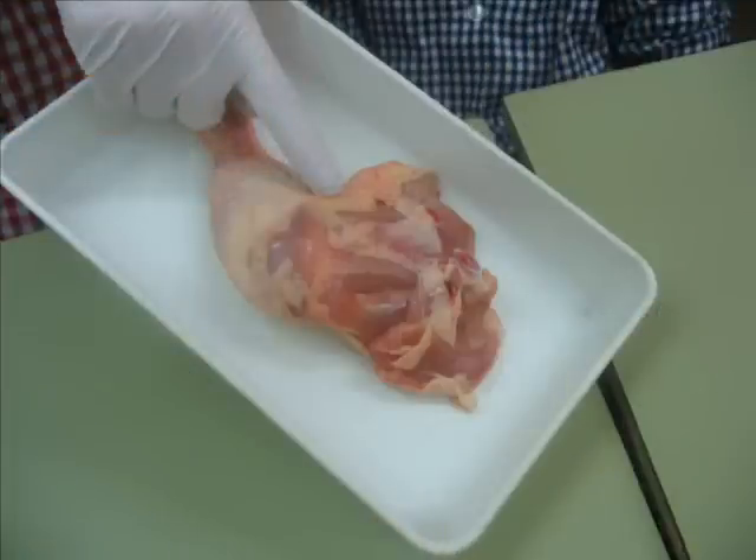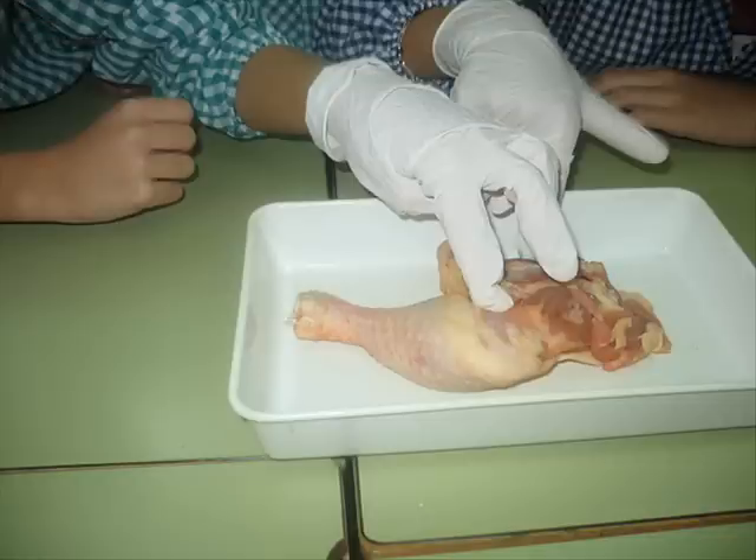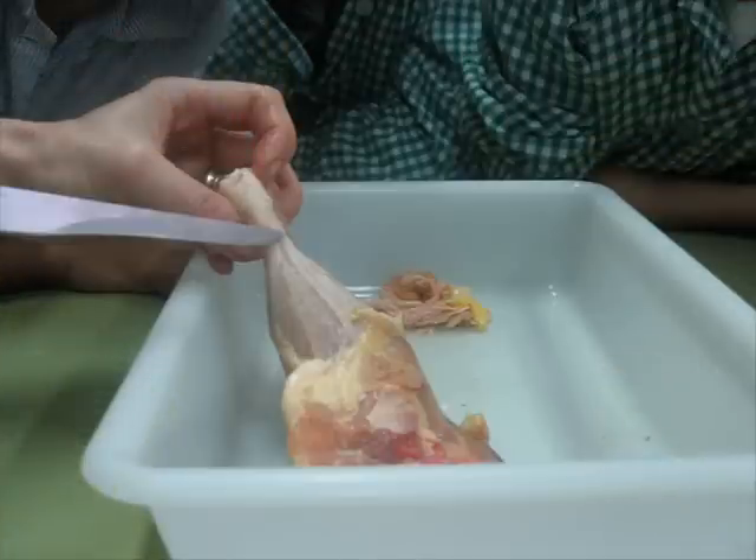Touch the chicken leg to check the soft and hard parts you need. Touch it and look for the bones. Take out the knife and the chicken leg.